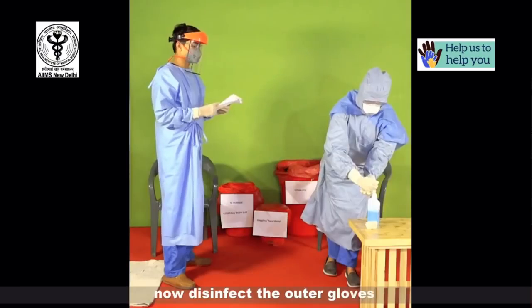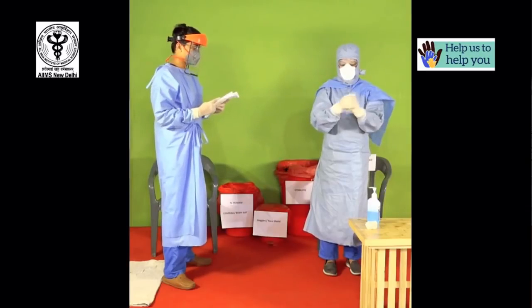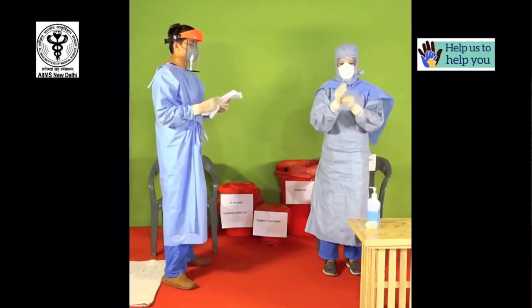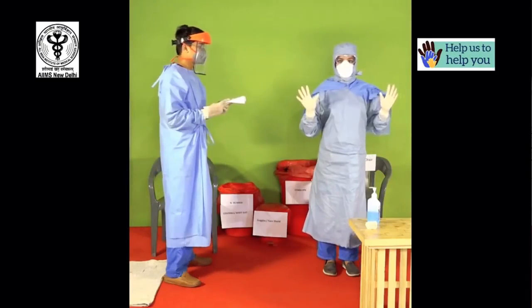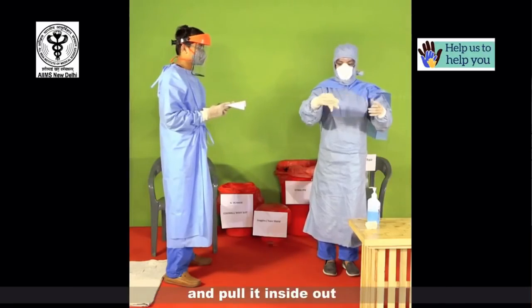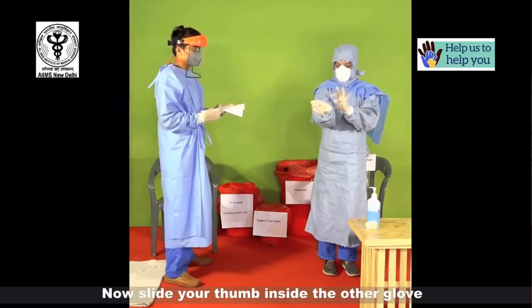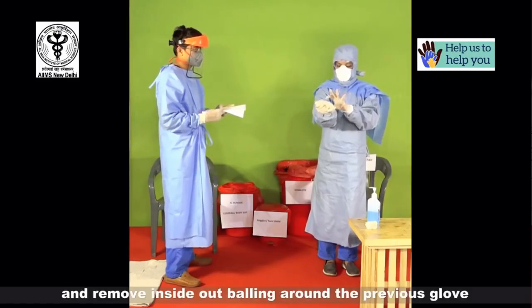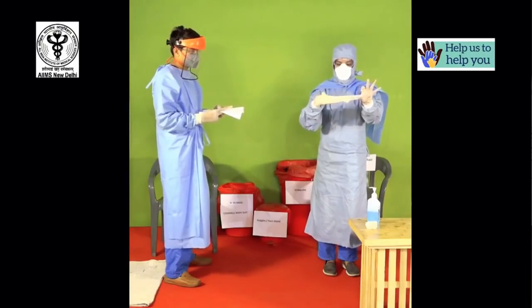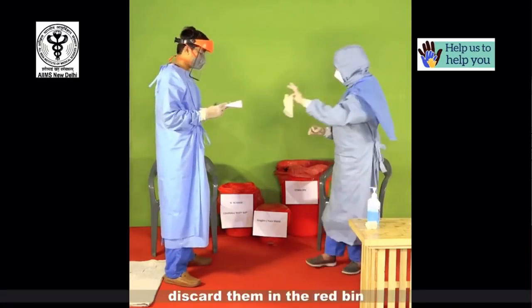Now disinfect the outer gloves. Pinch the first glove on the outer surface at the wrist and pull it inside out. Hold this glove in the other hand like a ball. Now slide your thumb inside the other glove and remove it inside out, balling around the previous glove making it into a single bag.